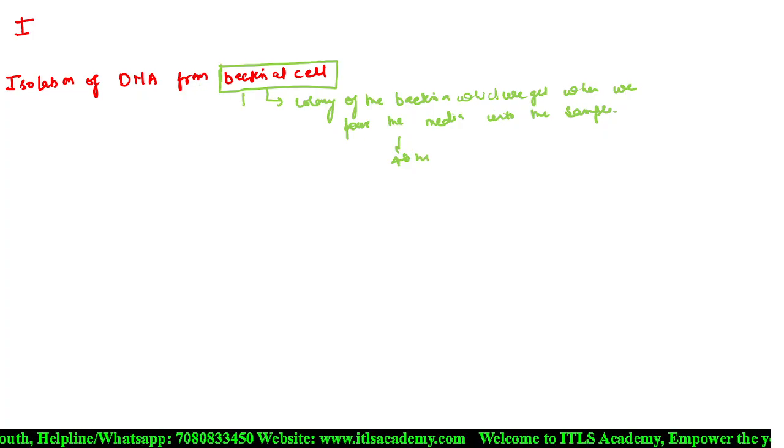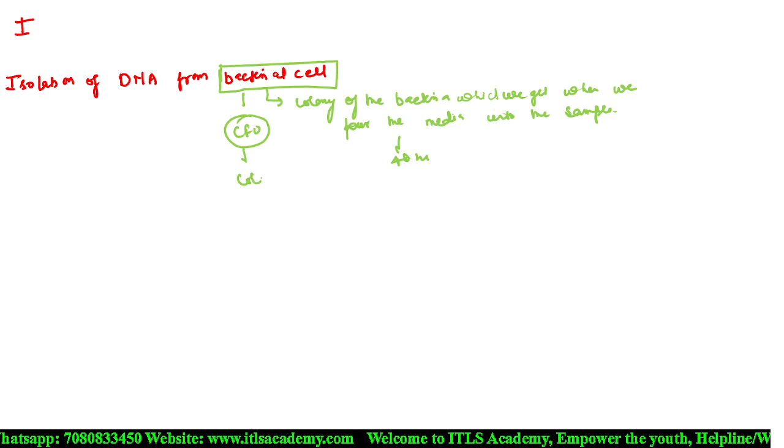And it is calculated as CFU, which means colony forming unit.